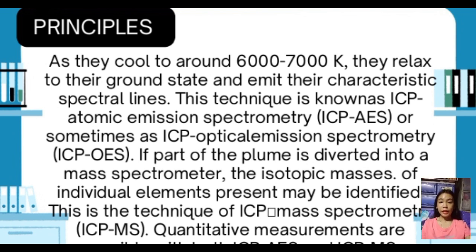Both ICP atomic emission spectrometry and ICP-MS facilitate quantitative measurements, allowing researchers and analysts to determine the concentration of various elements in a sample with high accuracy. These techniques are widely employed in various fields including environmental monitoring, materials science, and food safety, among others.